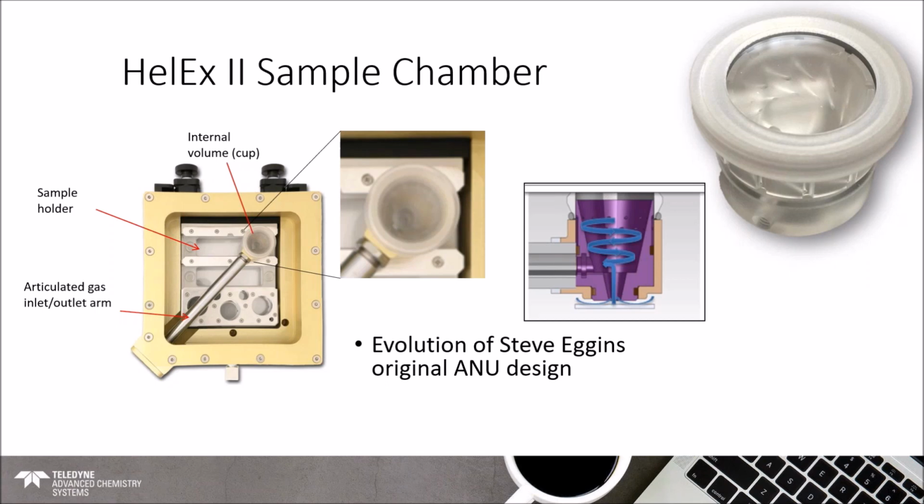The amount of time that it takes for all of that to happen is referred to as washout, and is an important term that you'll often hear when people are talking about laser ablation. About 5 years ago, having a washout time of under a second was considered very, very good. That's changed since that time. The HelEx sample chamber that you see here now has a standard washout time of between 600 and 700 milliseconds. So 600 to 700 milliseconds, also very strong.